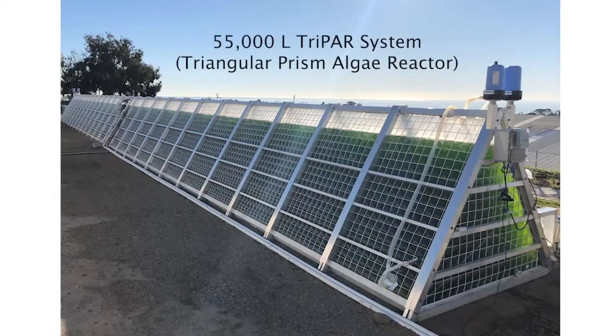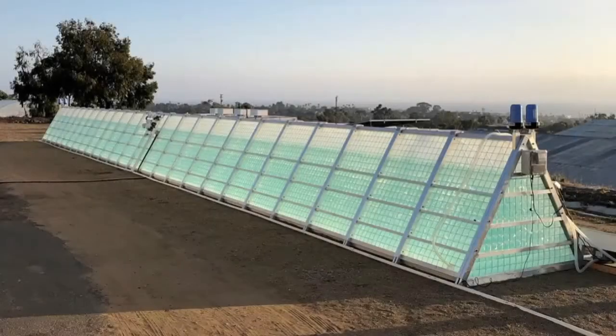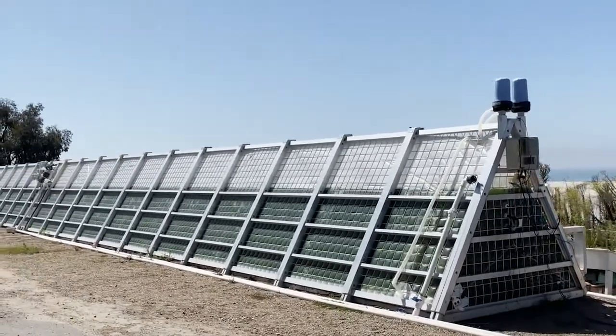Last but not least, we'd like to present our TRIPAR system, which stands for Triangular Prism Algae Reactor. This system was developed with funding from the National Science Foundation, and at 55,000 liters and 104 feet long, it's among the world's largest photobioreactor systems. The TRIPAR system is automated, incredibly modular, and very cost effective.